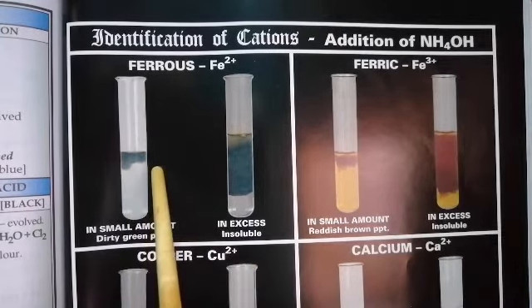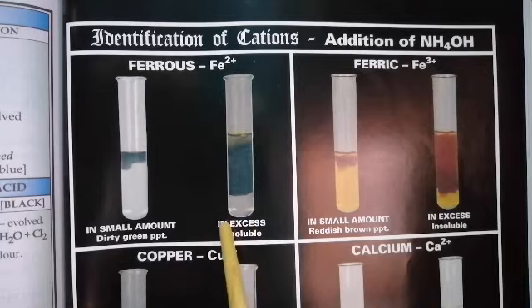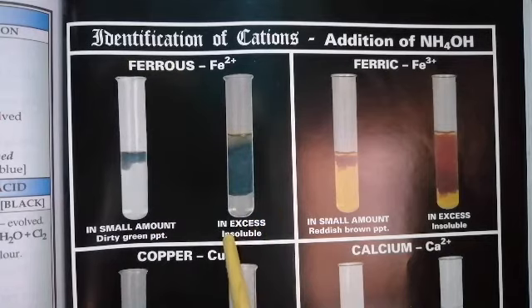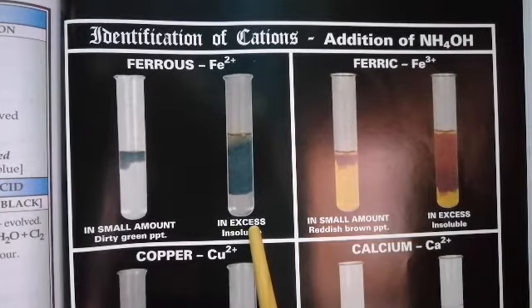And what do you observe when you add in excess of the alkali? You see that it does not dissolve. So we say in excess it is insoluble.